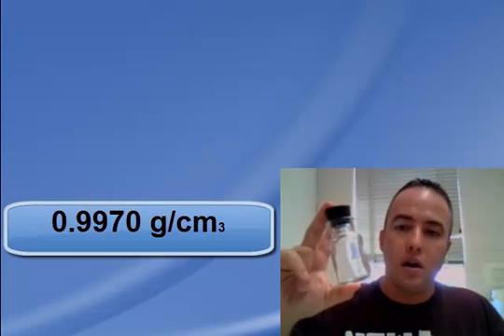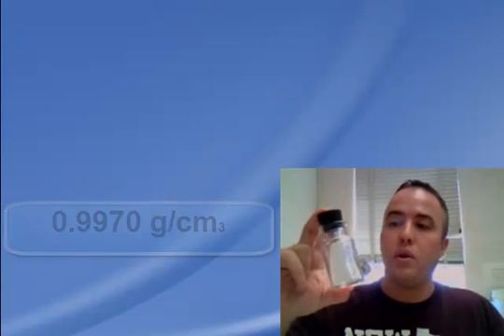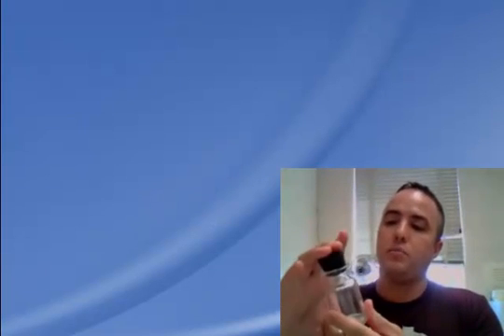We know that water has a very specific density of 0.9970 grams per cubic centimeter. Because we know that, we can determine the volume of this jar because water will mold itself to this particular instrument, and that's the good thing about water.